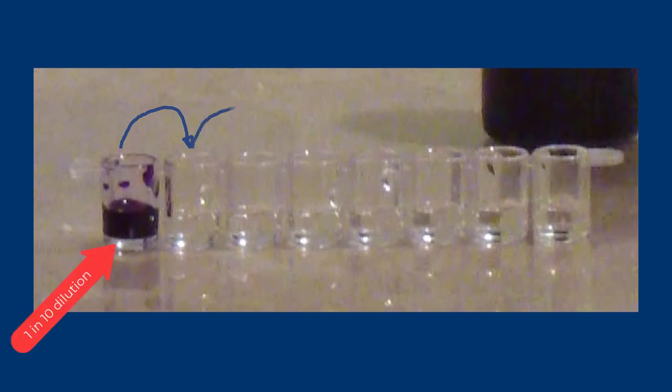The second well has a 1 in 10 dilution from a 1 in 10 dilution, making it a 1 in 100 dilution. The third well would have a 1 in 1000 dilution and so on and so forth.